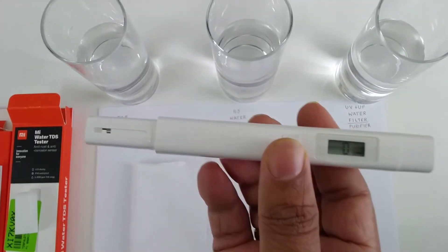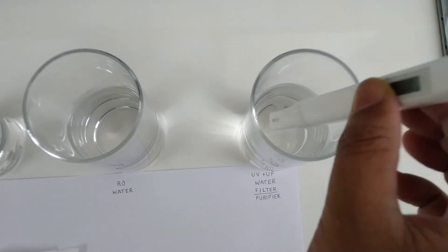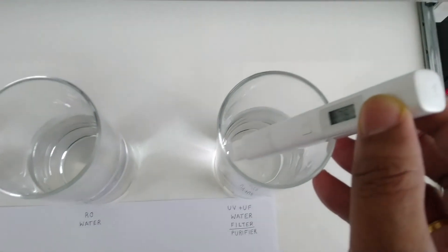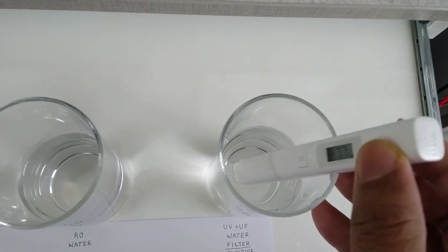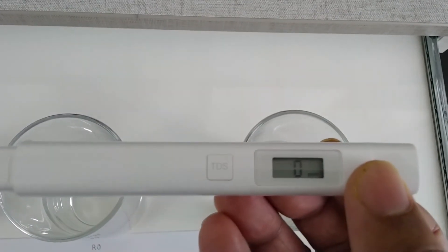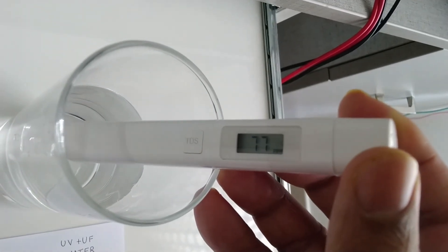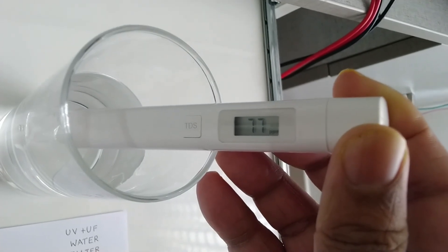Let's test the water samples one by one. First we will go for the UV+UF water purifier water. It doesn't have a hold function, so you have to hold the meter inside the water and it shows the value. It's showing 77 for the UV+UF water filter.